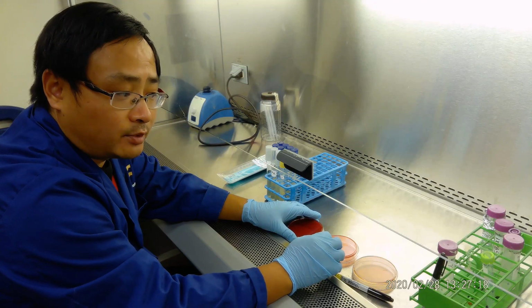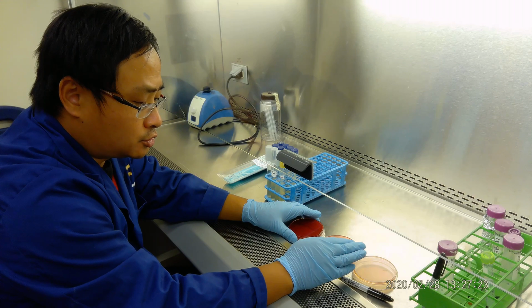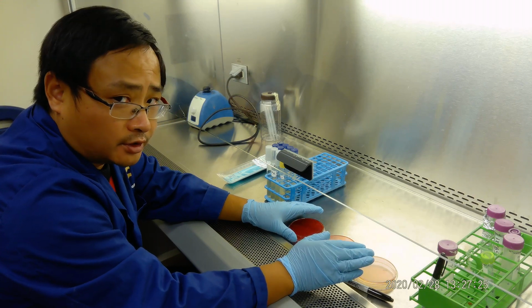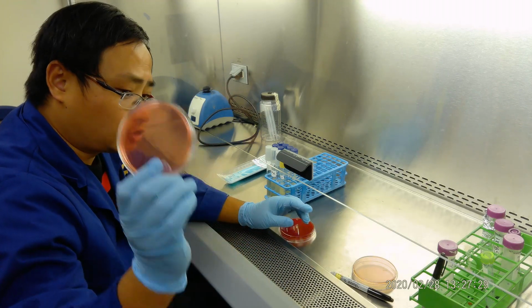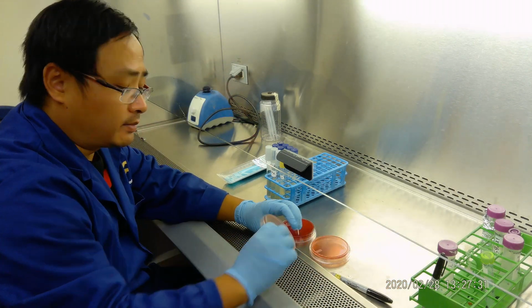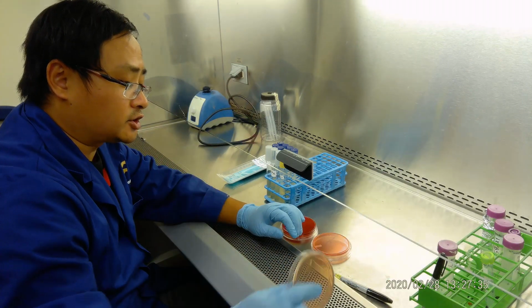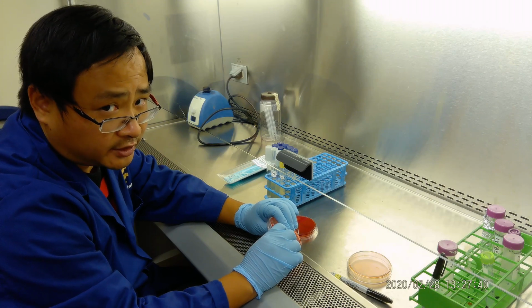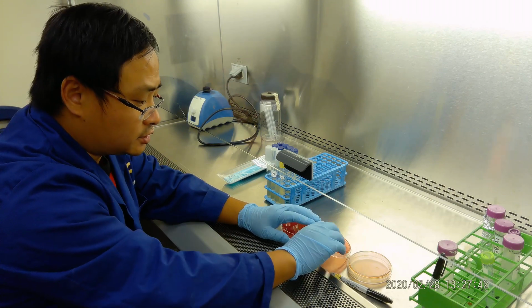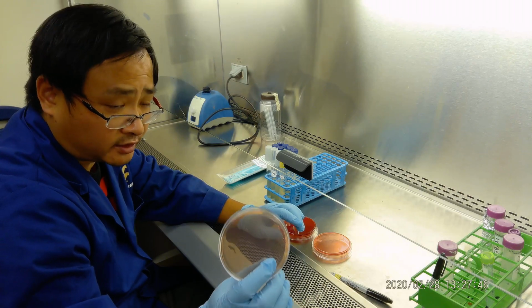So in this lab we will do two jobs. Number one is we will see the bacteria growing on blood agar, mannitol salt agar, and MacConkey agar. MacConkey agar is a selective media because of its crystal violet, so only gram-negative bacteria will grow. It is also a differential media because of the lactose fermentation, positive or negative.